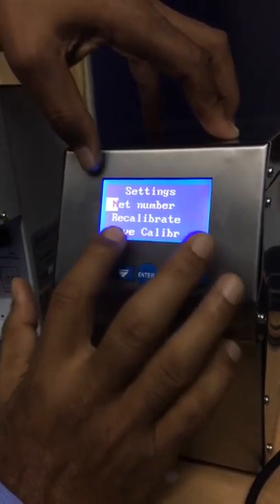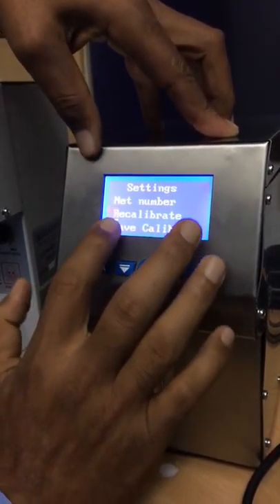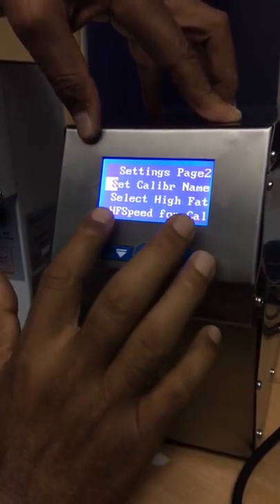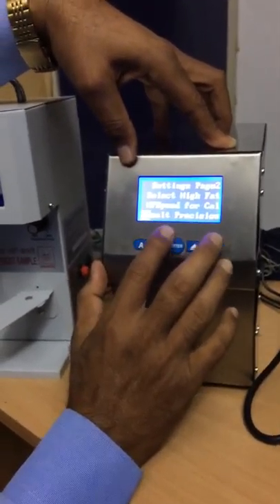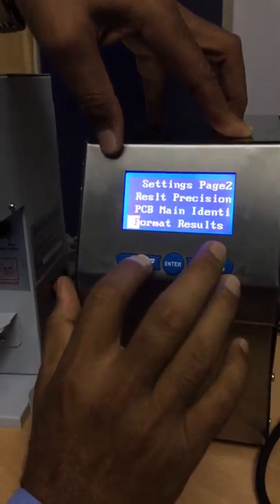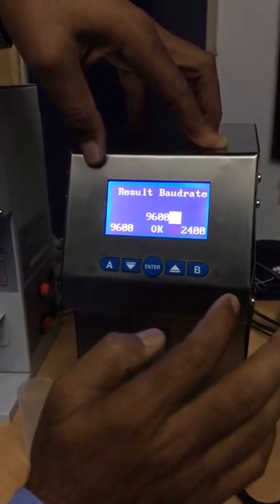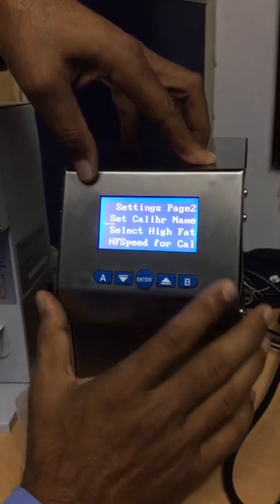In the Settings menu: Net Number, Recalibration — you can save the calibration inside the machine. Options to connect to a computer or PC are also there. Restore Calibration — saved calibration can be restored. This is settings page 2: you can name the calibration, select High Fat, set result precision, format result, and set baud rate. When you connect this machine to a PC or DPU you set the baud rate — for example 9600 — and you can change it to 2400 if needed.